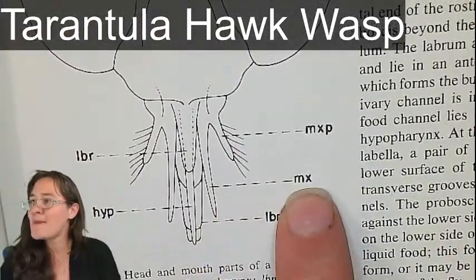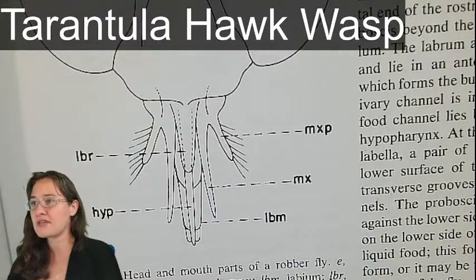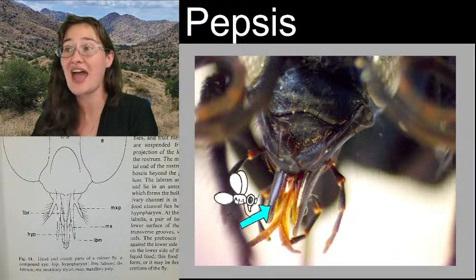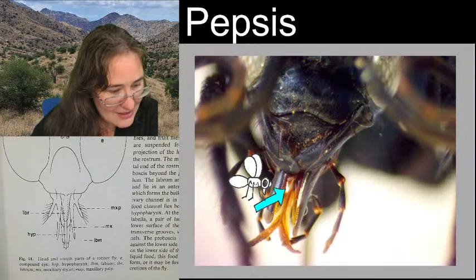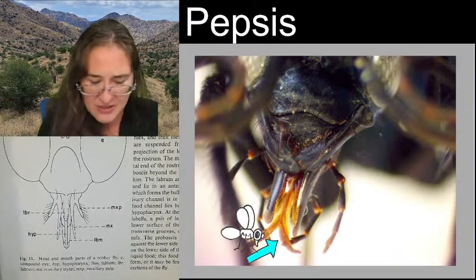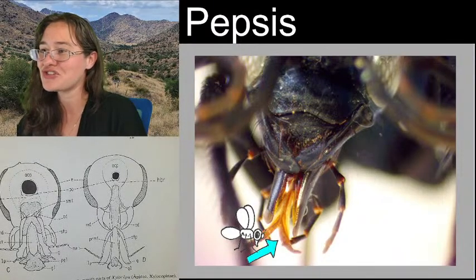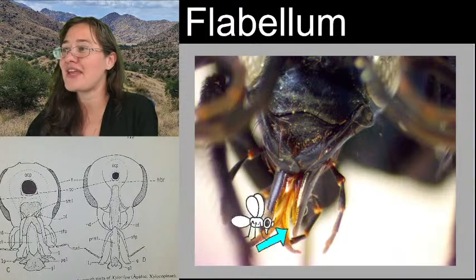So, MX stands for maxillary. So, the outside, that sheath of that mouth part is the maxillary. So, right here, that sheath-like mouth part, that's the maxillary, and all insects have it. It's just a different shape. And my guess, because this tongue segment is really the segment that's unique to the wasps that everyone else doesn't seem to have, is that it's something else. So I was checking it out to see what that's all about, but that's just called the flabellum. If you guys would like a new word, I don't think I've shared this word with you yet. That's the straw-like mouth part right here in the center. We call it the flabellum.